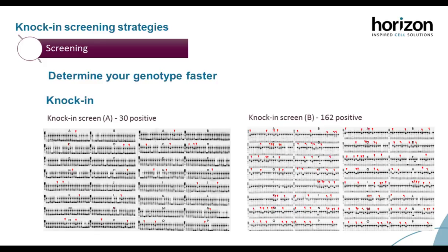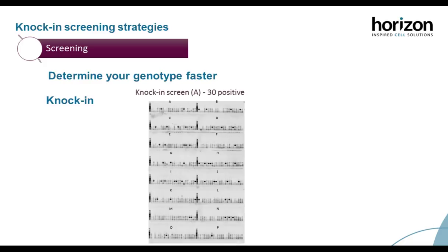And the difference between these two is that it is the exact same targeting reagents, however, it is different cell lines. It really does show that the different cell lines, their different ability to even take up the CRISPR reagents and the targeting reagents, can affect how they will perform later on.